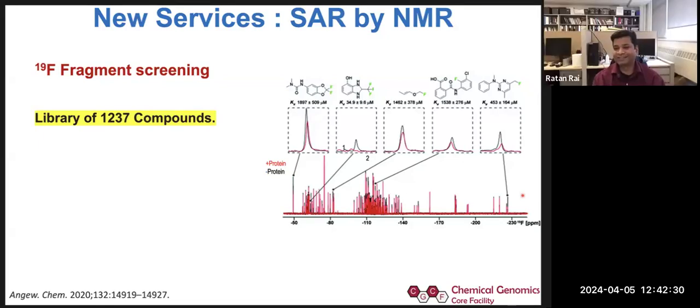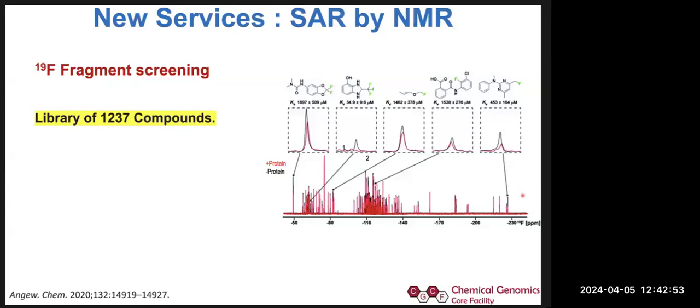That's true. For one, for APE1, we have screened up to 200 compounds and we find one hit. And we proved through different experiments that it's a real hit. So there will be no replacement. Right, yeah. Once you have something real like that, you can go from there.